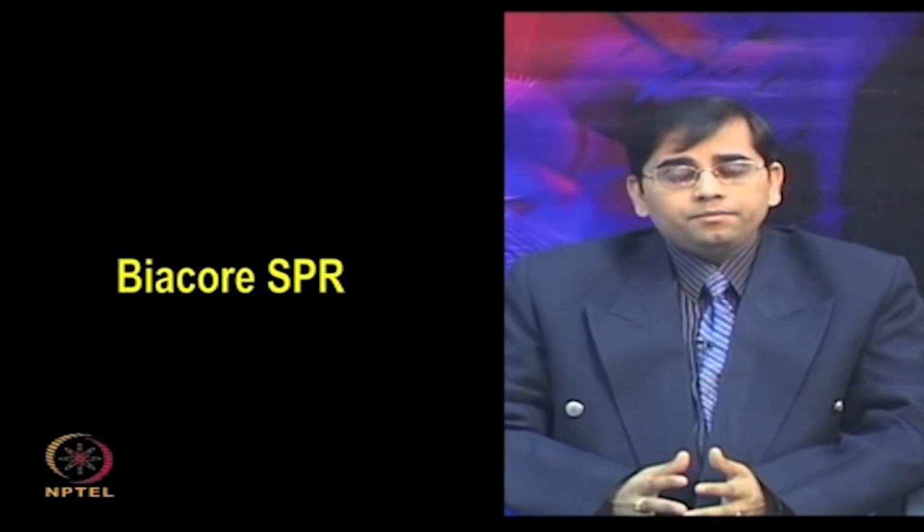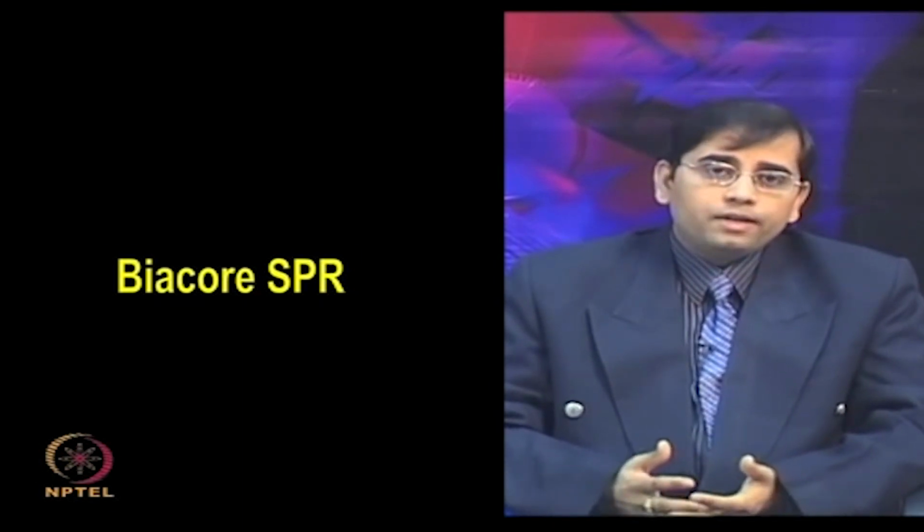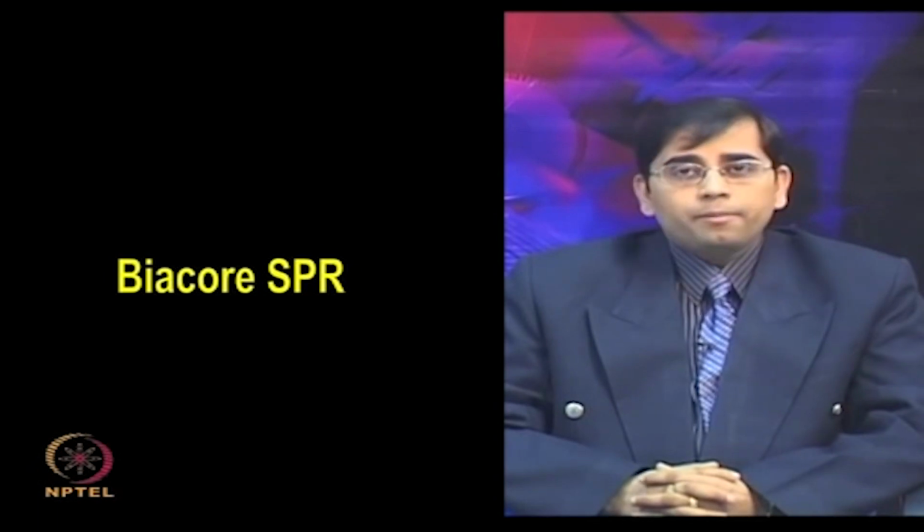There has been growing interest in commercialization of SPR biosensors, which has led to a number of systems available in the market. The commercial instrument from Pharmacia and then Biacore became available in 1990.